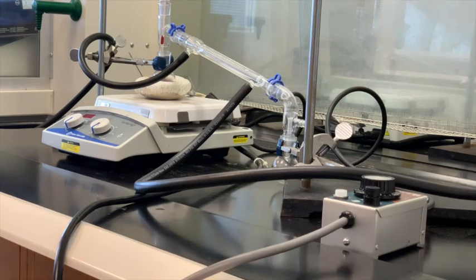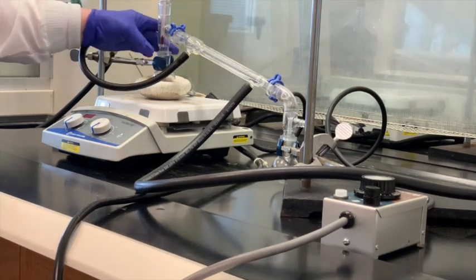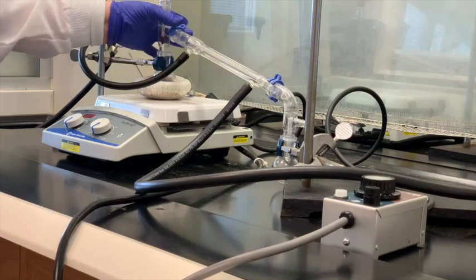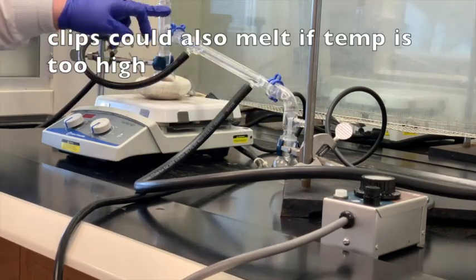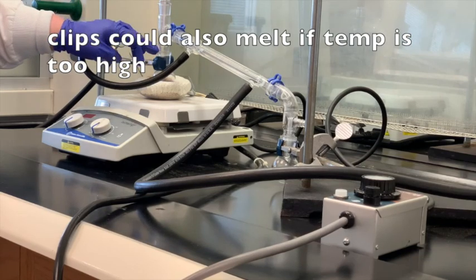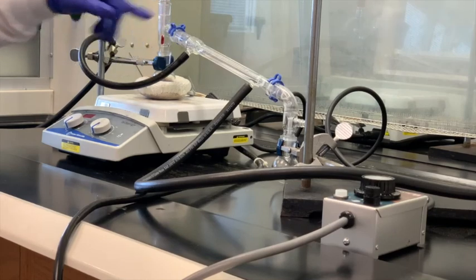I would never put a blue clip here. I would never put a blue clip here. And they are temperature sensitive. If you have it here at the distilling flask and you're heating it pretty high, it is possible for that blue clip to melt because they are plastic.